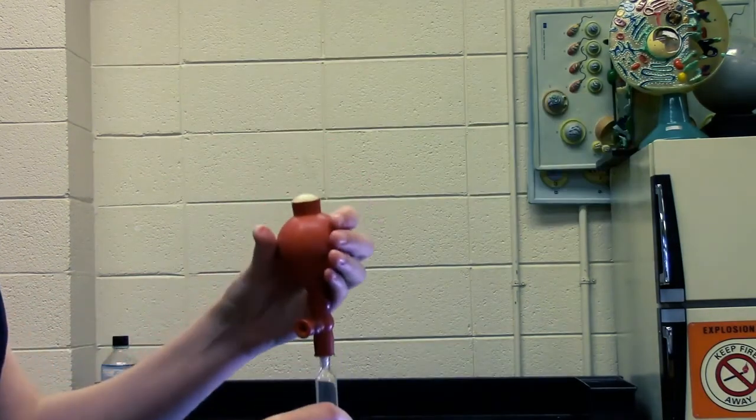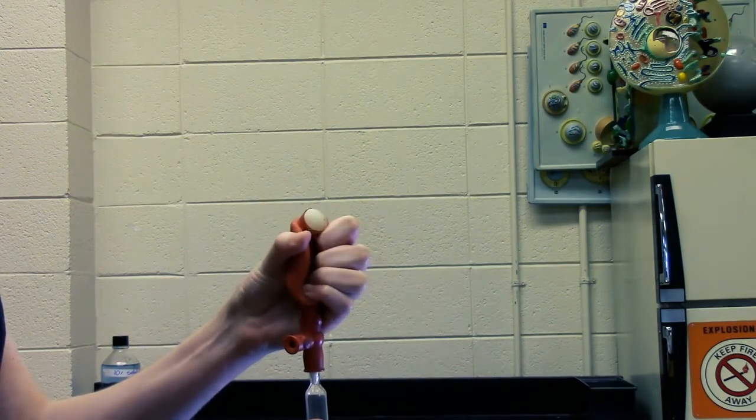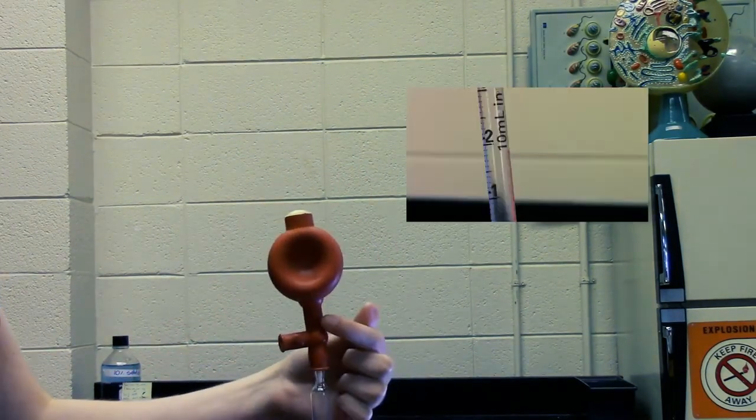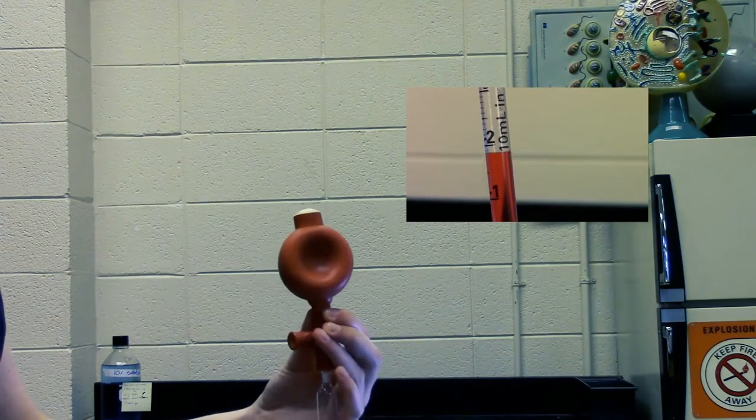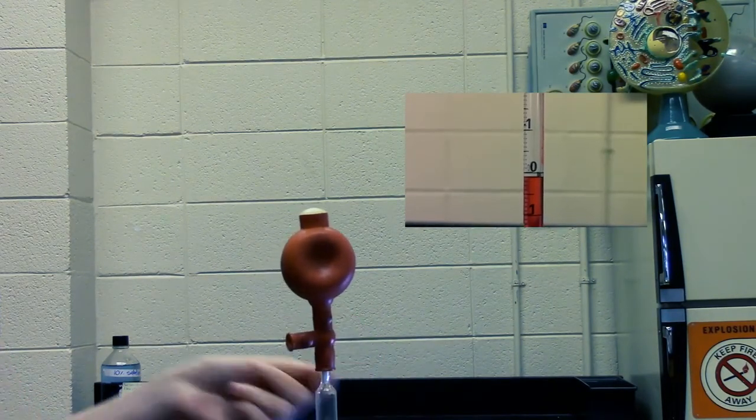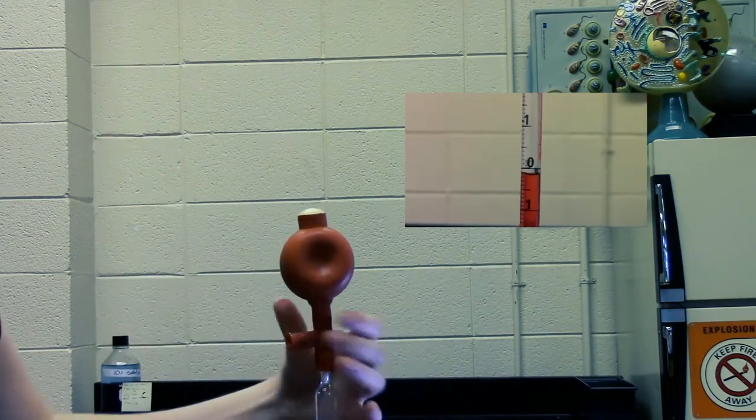This pipette is like a turkey baster. First, squeeze the bulb, then press a knob to take in the liquid and then press a knob on the side to release it.